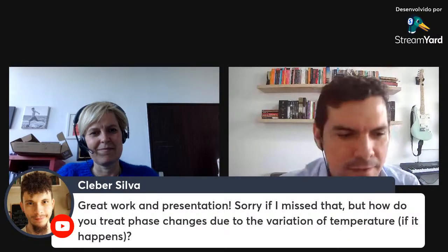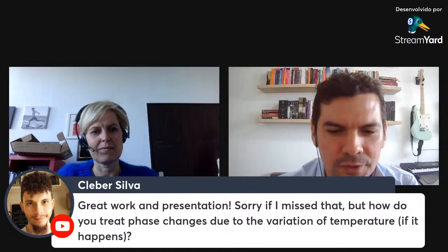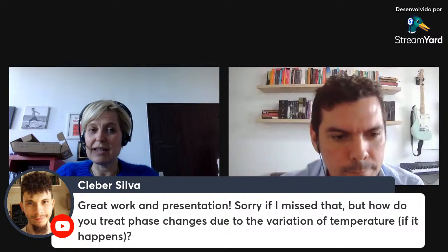And so one of our students has a question here. How do you treat phase changes due to temperature? In none of the investigations that we have performed, there was an expected phase change, but it is something that can totally be done. The easiest thing is probably to look at the diffraction pattern, where you would see a change in symmetry or a change in lattice parameter. And sometimes people also use that technique in order to calibrate the temperature that they have in the microscope.